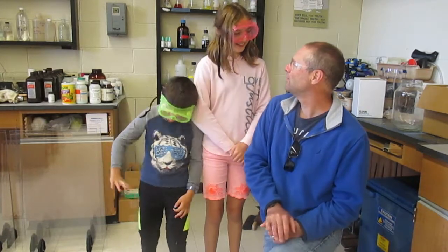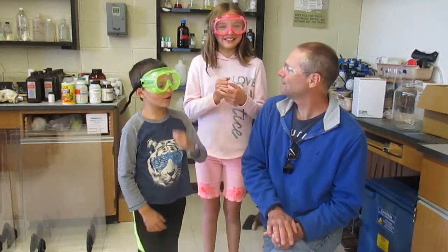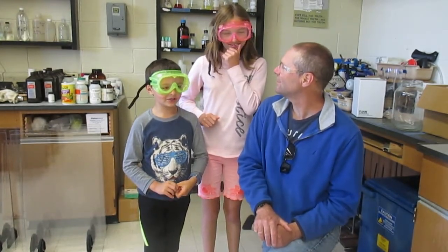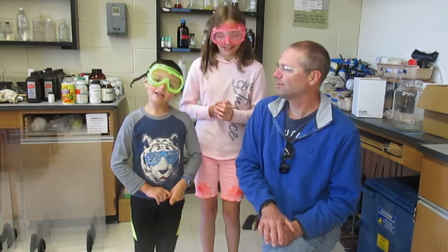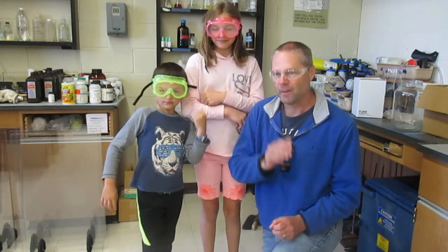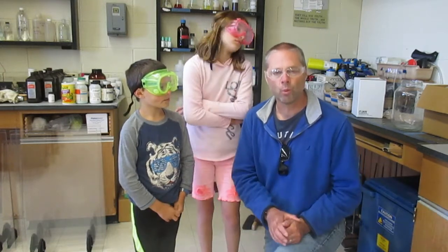So what lab are we going to be doing today? What's the purpose of today's lab? Since there is casein in dry milk, both Josiah and Ezreal are going to do a trial. It's important to remember that this lab requires 3 days. Once you extract the casein out of the dry milk, we have to let that dry for 3 days. Once it is dry, we will then weigh the casein that we've extracted. This lab takes some time simply for the drying process to occur.